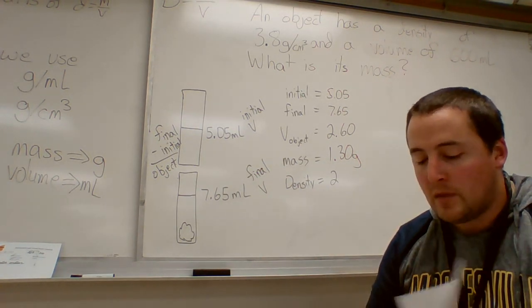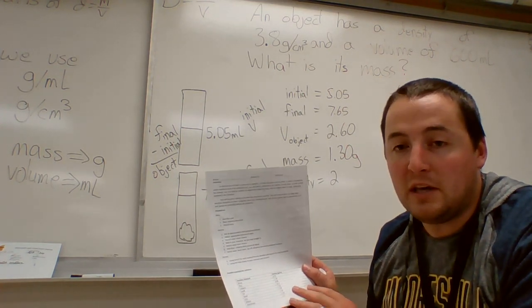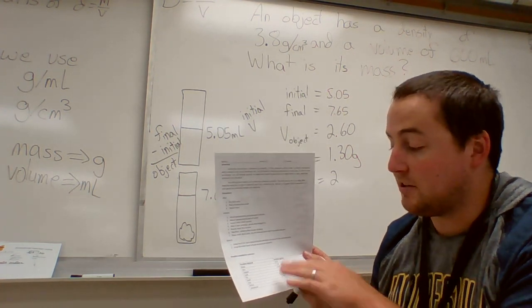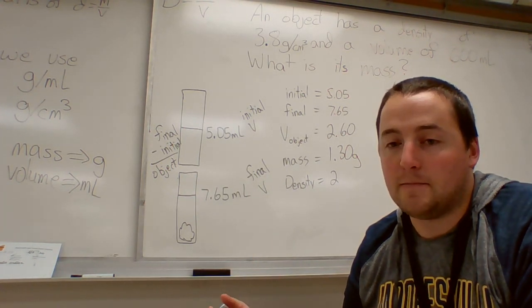with. Now, this particular material I just did does not have a match on this table, which means it is not any of these objects here. It's not even close to any of these objects here. So we would have to then go and figure out what exactly it is.